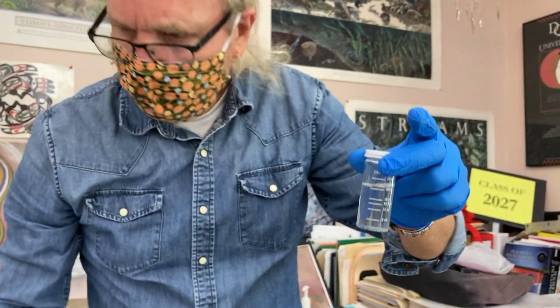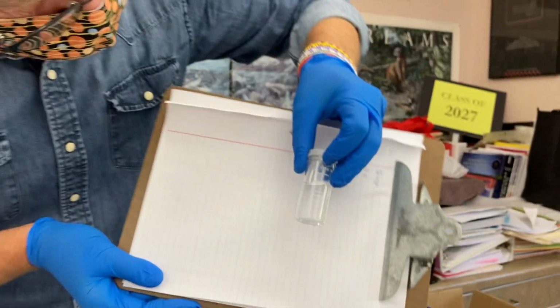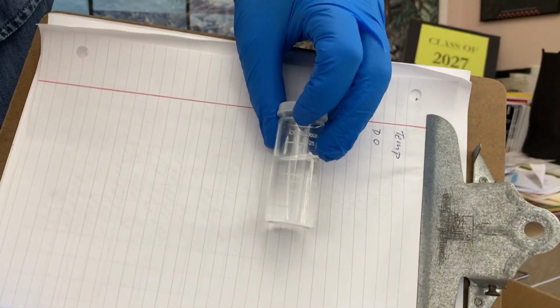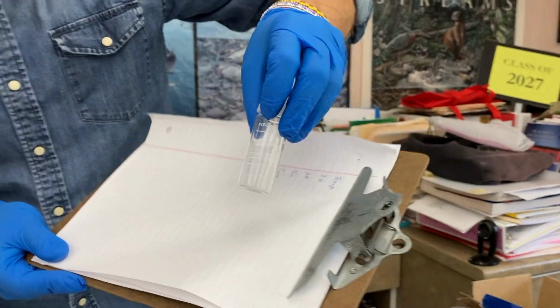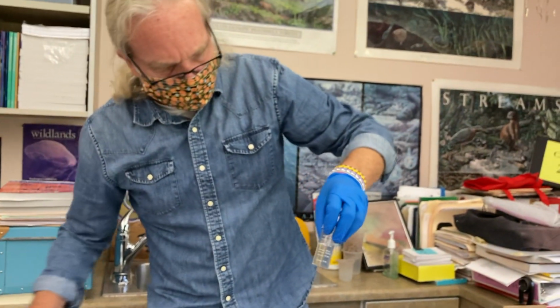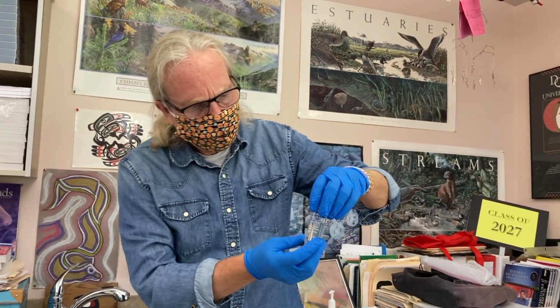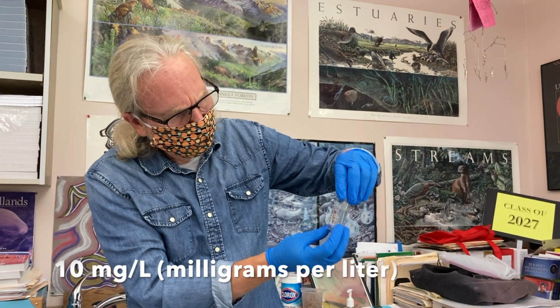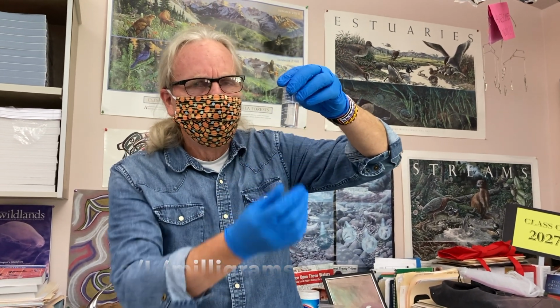Let's just hold up a piece of paper. Make sure. Yeah, I think that's good. All right, so for our intents and purposes, that's like 10 milligrams per liter of dissolved oxygen. All right, there we have it.